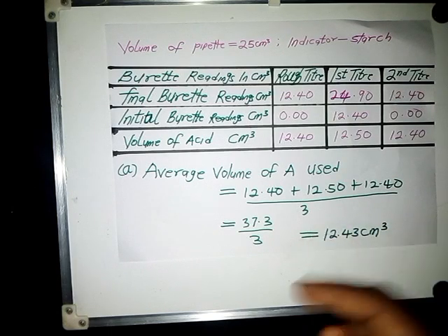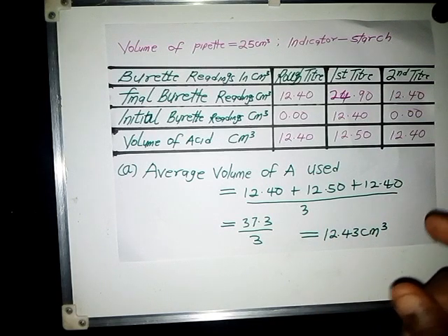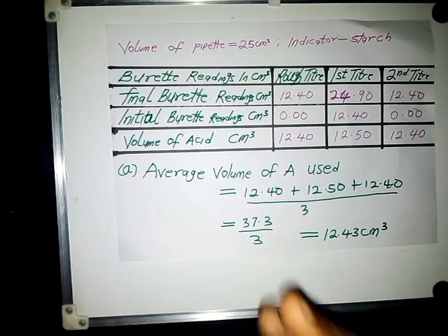Then you start titrating. Remember, you don't add the starch yet. As you're titrating, you have to make sure that the golden brown color of iodine fades until it's pale yellow, or very light yellow. It's after we get to that point that you add your starch. Then you get blue black. Then you add 1 or 2 drops of the thiosulfate with constant shaking. We change it from blue black to colorless.